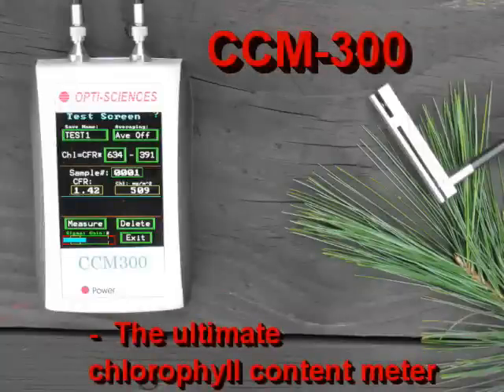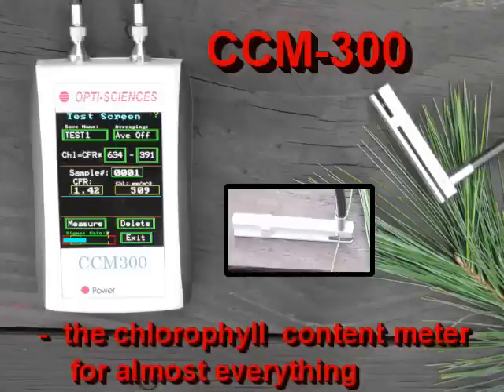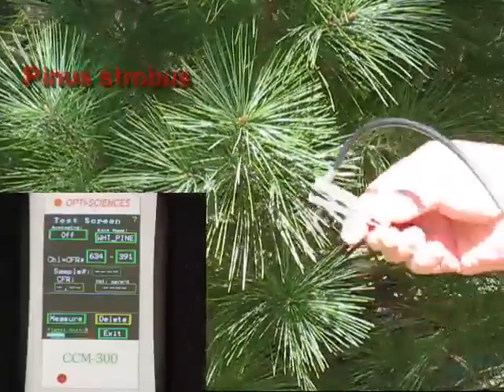The CCM300 was designed to overcome the limitations of existing chlorophyll content meters to work with almost all plant sample types. Samples that cannot be measured by traditional chlorophyll content meters can be easily measured with the CCM300.